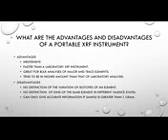The disadvantages are that there is no distinction of the variation of isotopes of an element. There is no distinction of ions of the same element in different valence states. Portable X-ray fluorescence spectrometer instruments can only give accurate information if the sample is greater than 1 gram.